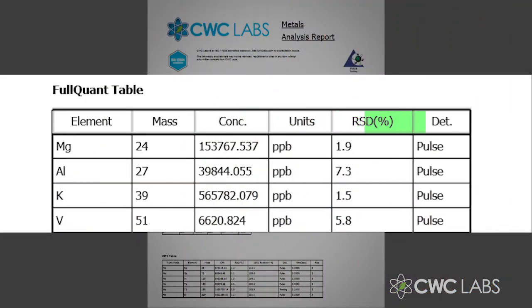And in terms of accreditation, believe it or not, the accrediting agencies normally don't require you to be any better than plus or minus 20 or 30 or sometimes even 40%, depending on what you're looking for. It varies with pesticides. It varies with different chemicals that you're trying to look for. But for ICP-MS, plus or minus 20% is considered very, very accurate, very acceptable by government standards, FDA, USDA, and so on. And now, finally, the last column has to do with the detection mode.